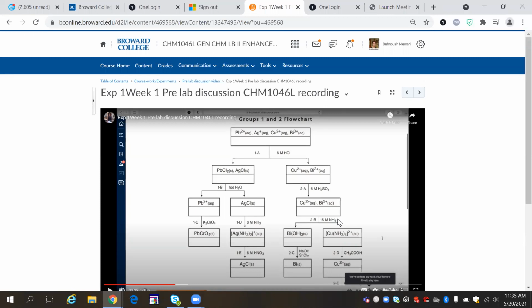So at the bottom of these little boxes, what do we put in that blank space at the bottom? The empty spaces, you write down your observation. Like right here, basically you just say a solution, a mixture of all. You just put the color of the solution, whatever it is, after you add HCl. And when you separate it, here is the color of the solution.